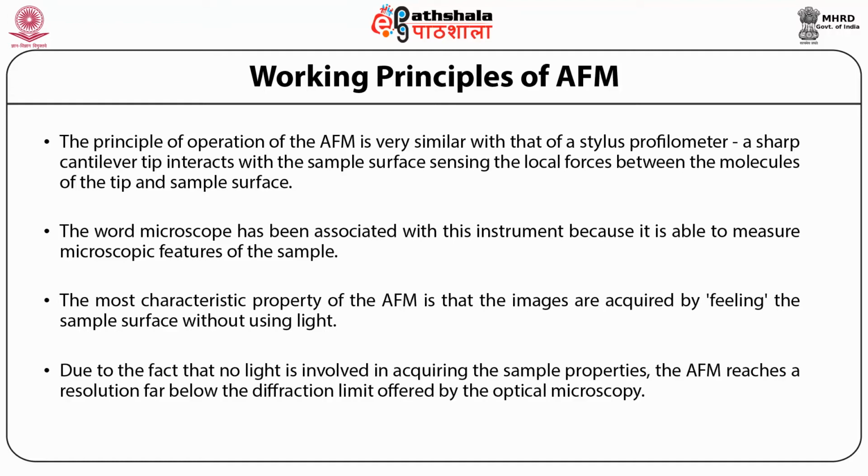Due to the fact that no light is involved in acquiring the sample properties, the AFM reaches a resolution far below the diffraction limit offered by optical microscopy. Its resolution is limited only by the tip radius and the spring constant of the cantilever.